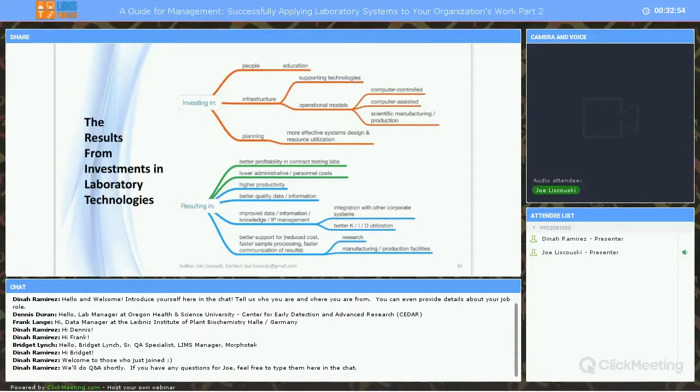If you're looking at isolated investments to solve fix-the-bottleneck issues, or are looking for limited task-oriented purchases, your case may be simple to make. The downside of that methodology is that you'll find that as your needs grow, particularly if they include informatics technologies we've already covered, you may find yourself either boxed in by previous purchases or having to scrap earlier work and start all over again. One way of avoiding this is to do a lab-wide plan first, and then if you purchase individual components, make sure that they fit the plan so that the pieces come together at the end.